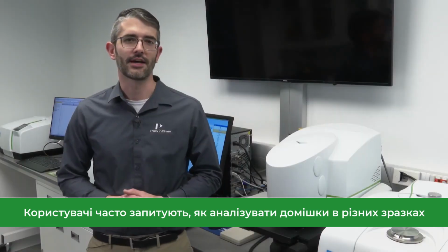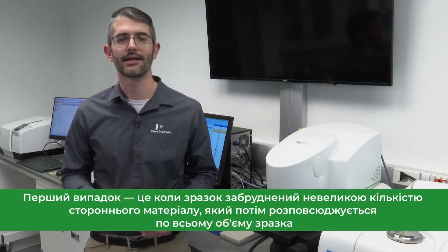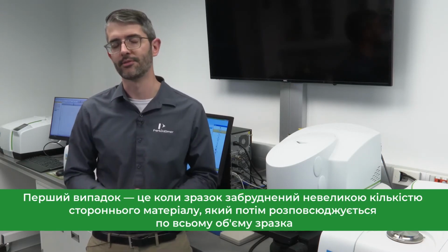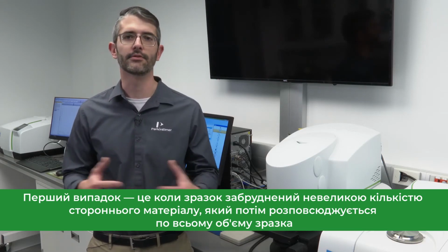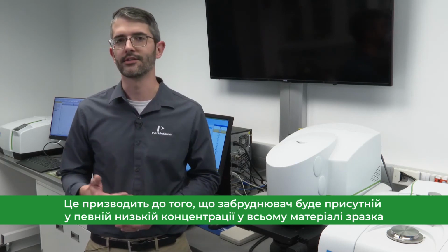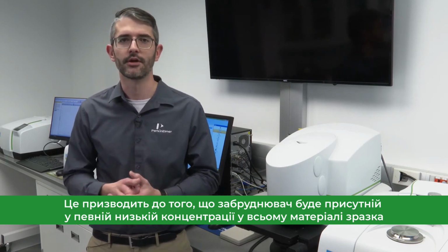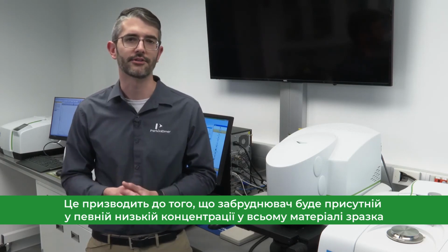Customers will often ask how to analyze contaminants in their samples. You may think of contaminants as falling into one of two categories. In one category, the sample material is contaminated by a small amount of foreign material, which is then diluted through the entire body of sample material. This dilution causes that contaminant to be present at some low concentration throughout the entire body of material.